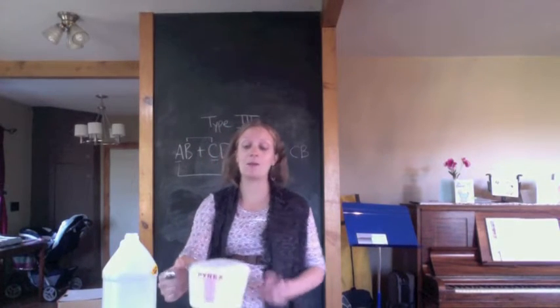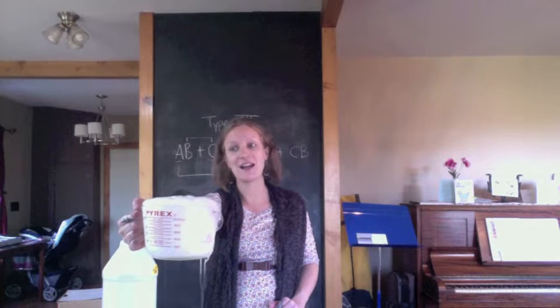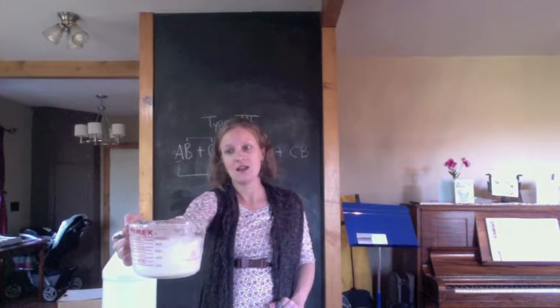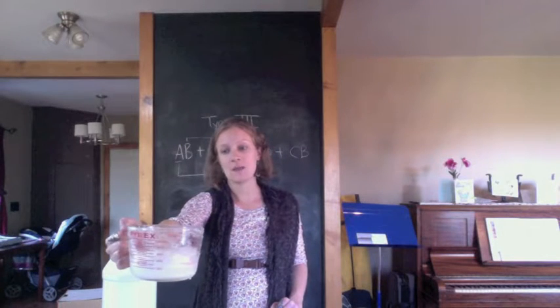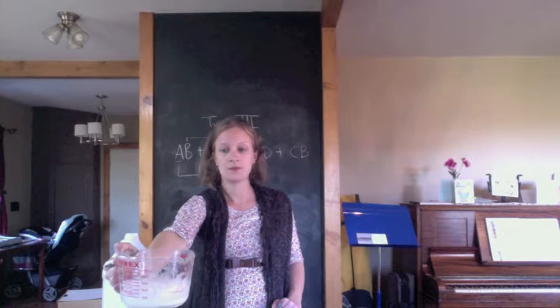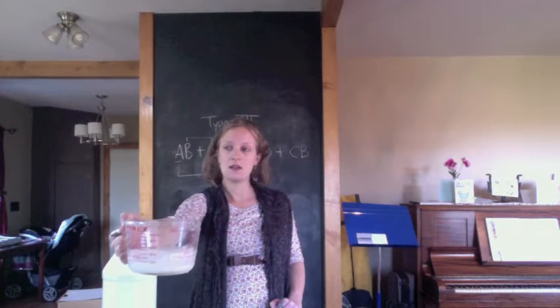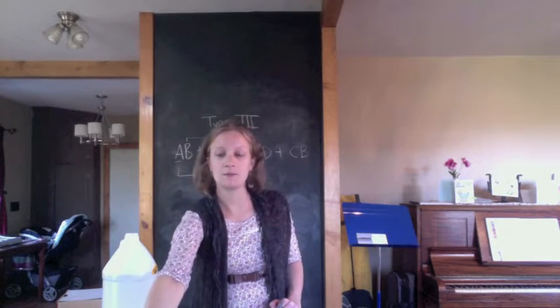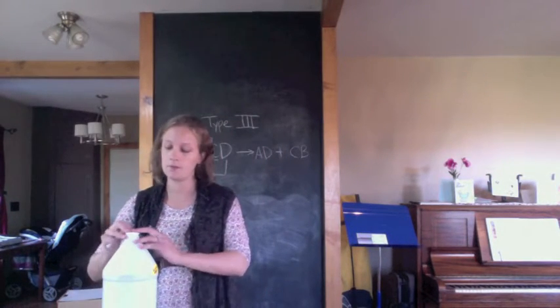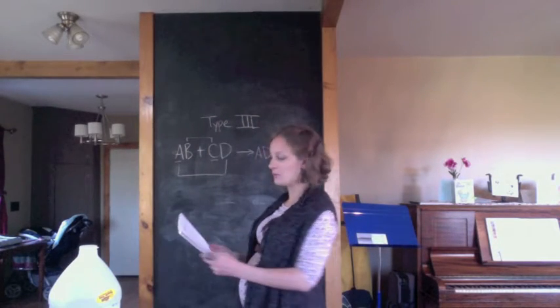And again, we're bubbling over even, making lots and lots of water and carbon dioxide. That's a good reaction. That's a really good demonstration of the production of a gas using two binary compounds, and it's a double replacement reaction. So I'm going to write that on the board. Always put the top back on your chemicals, even when you're working at home.